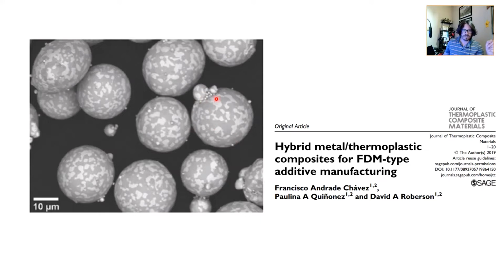So you look at the different particle size distribution of the solder. This is a tin bismuth eutectic, and one thing that clues you in to the fact that this is a backscatter image is we see chemical related differences. So there's a tin rich phase and a bismuth rich phase, and if you want to figure out which is which, you can look at the periodic table.